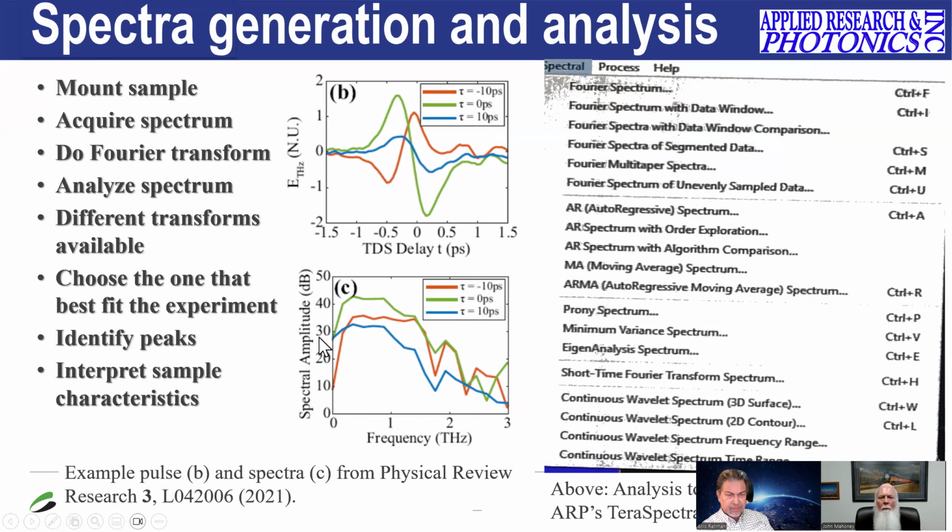But anyway, this is the time domain signal, and if you take the Fourier transform, you get the frequency domain signal. The y-axis is dB or loss, which is the absorbance. So we are now tracking the absorption by different resonances in a molecule by terahertz time domain spectroscopy.